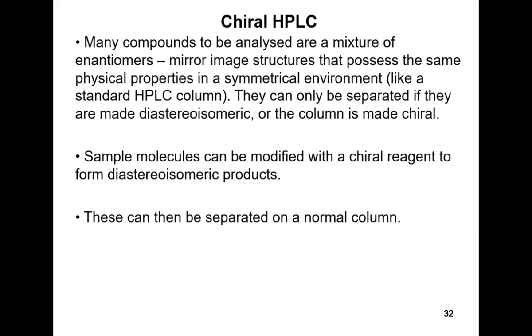Okay, so I'm going to finish off. I don't think I've got time to move on to the size exclusion chromatography. So I'll just focus on explaining this idea of chiral HPLC quite carefully.